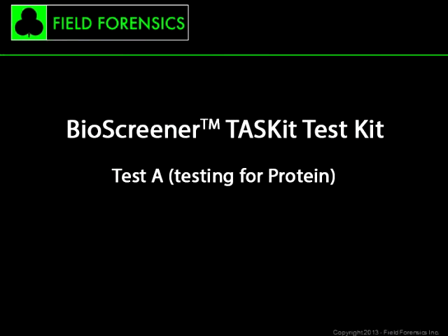The BioScreener Taskit is a two-part test, with an option for completing a third test when necessary. Test A is for Protein.